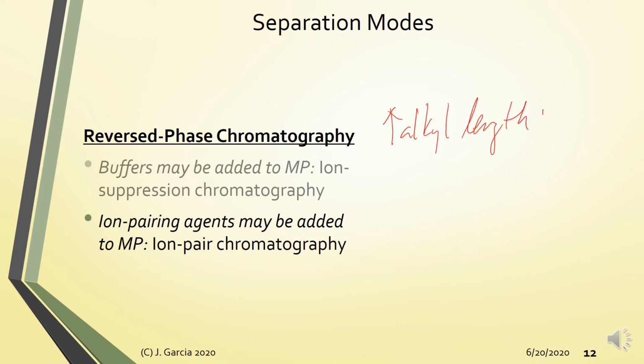Alright, so what are the different points you have to consider in the use of ion pairing agents? In general, as you increase the alkyl chain length, you are also increasing the retention time for the analyte with which the ion pair agent pairs. The pH of the eluent, of course, will also influence the retention time.